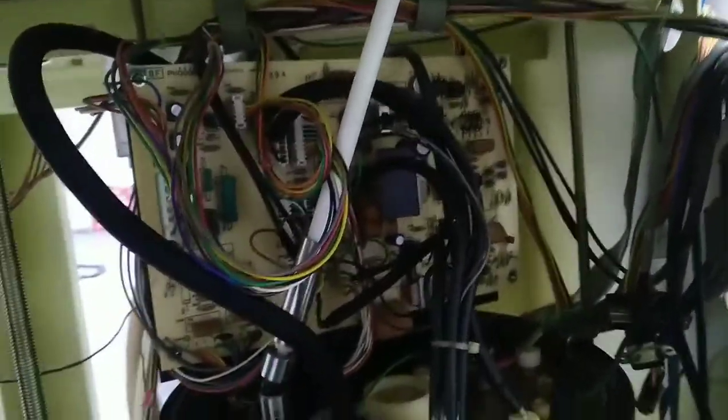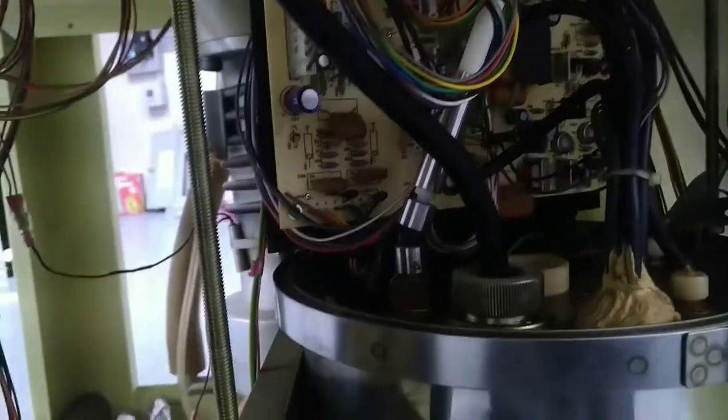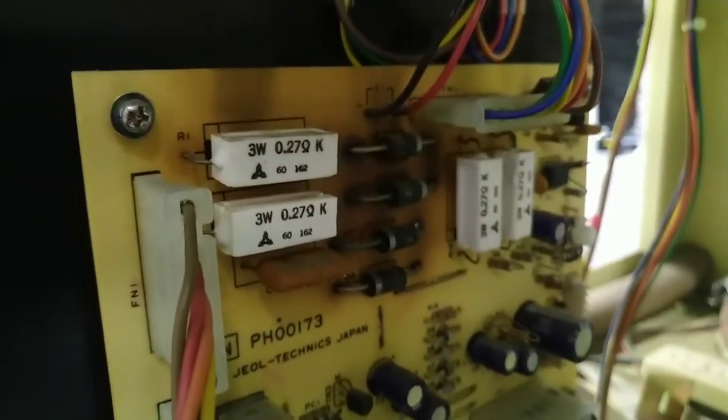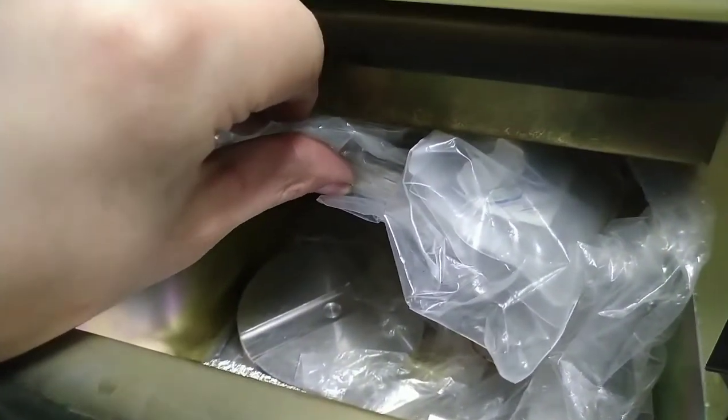Other than that, seems like only the high voltage supply board is here. I can see some connectors that would go to the other unit. Not really sure what that is, but it's definitely gotten toasty on the rectifiers. And then there are some spare parts — maybe slide holders and various fixtures in here. So that's always pleasant.